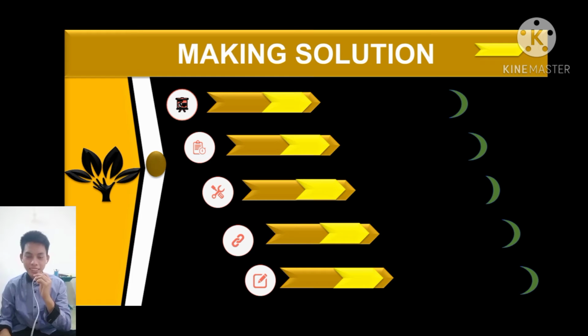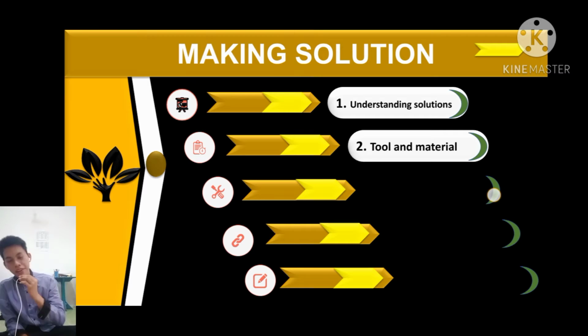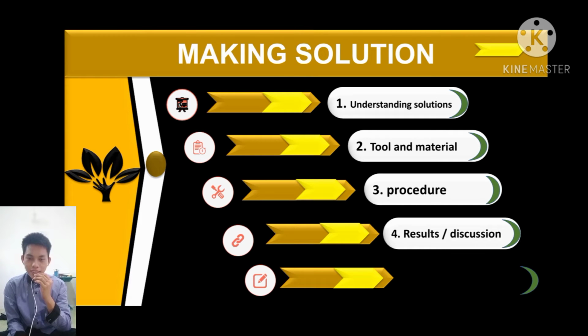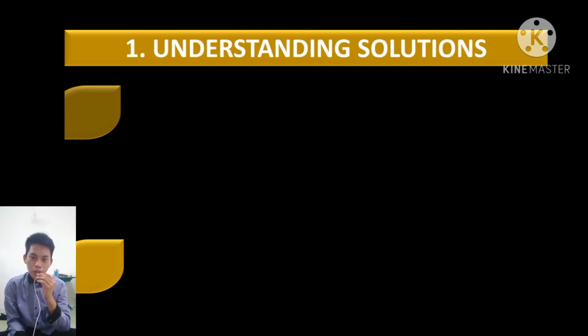Making solution. I have 5 points of discussion. First, understanding solution. Second, tool and material. Third, procedure. Fourth, result or discussion. And finally, experiment analysis. Okay, the first discussion about understanding solution.